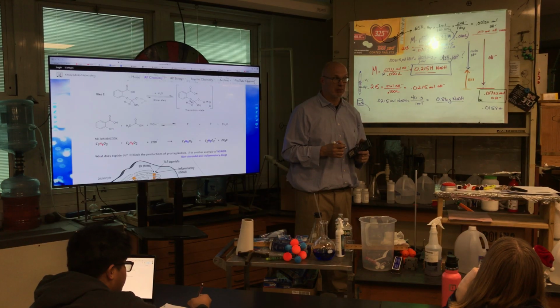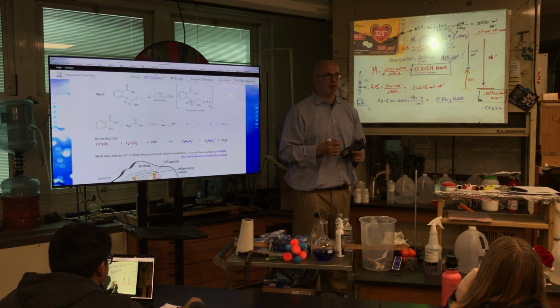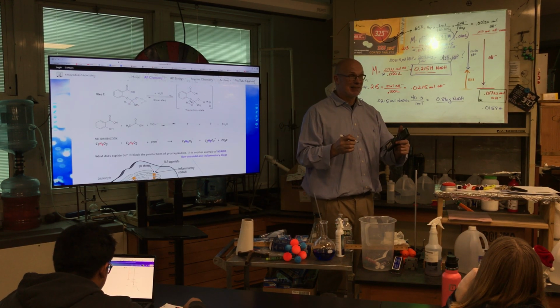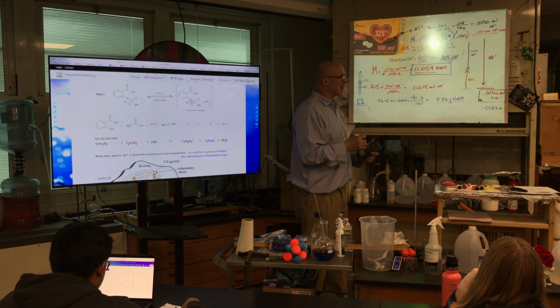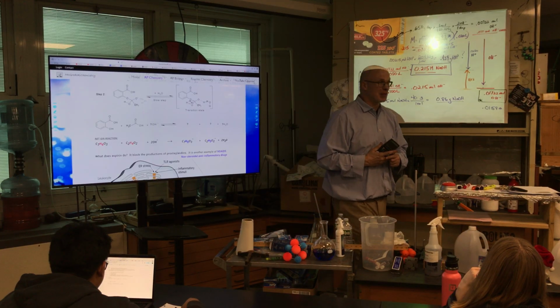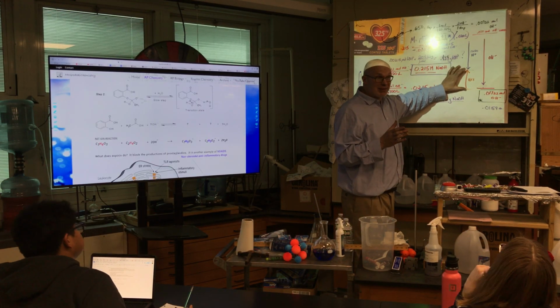How are we doing? Did I lose you? Good, because I lost everybody else in the first period. But knowing that information, I changed the way I presented this. Now, for those that I did lose, how do we solve for the tablets? I need to back titrate with HCl, correct?